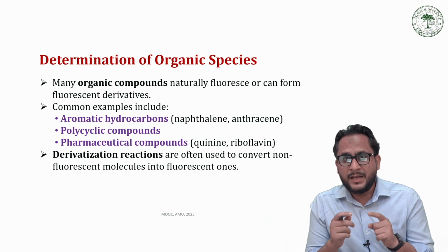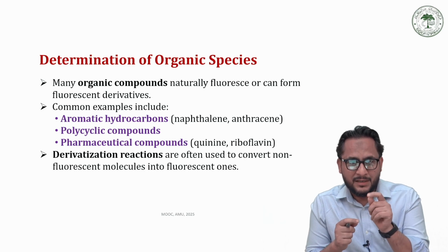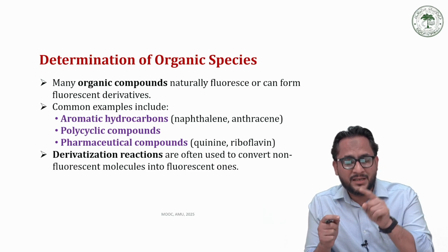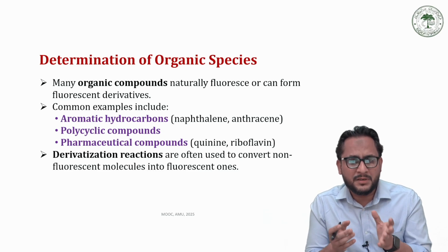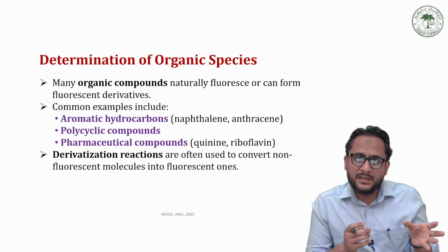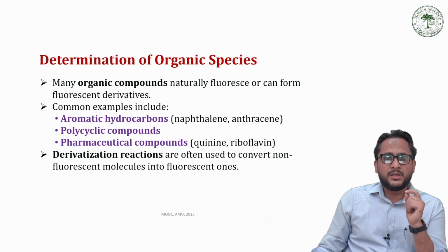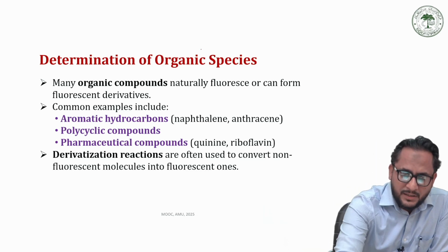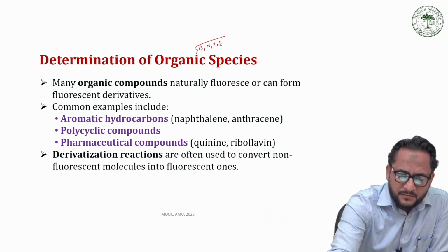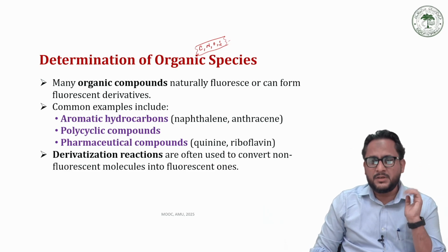So, like the previous unit, which is mainly devoted to elemental analysis, the atomic absorption and atomic emission techniques can help you to identify heavy metals. Mainly it is devoted to metals, although some metalloids can be analyzed. Even with AES using ICP, we can go for refractory metals which have very high melting points. We can analyze lanthanides and a few actinides as well. Even in some cases, we can identify some non-metals like carbon, nitrogen, oxygen, sulfur, although there may be some reliability issues with these results.